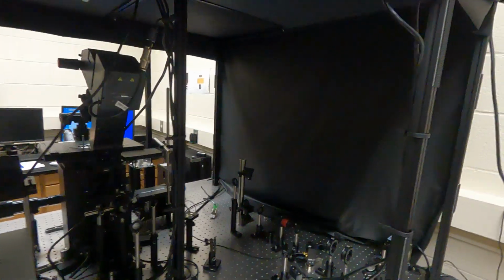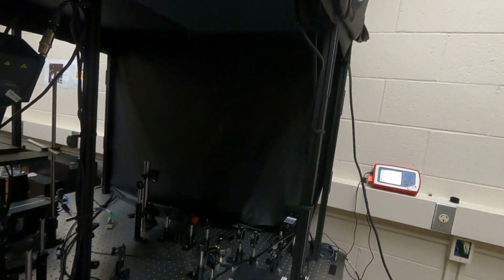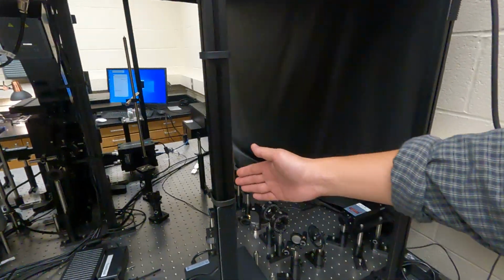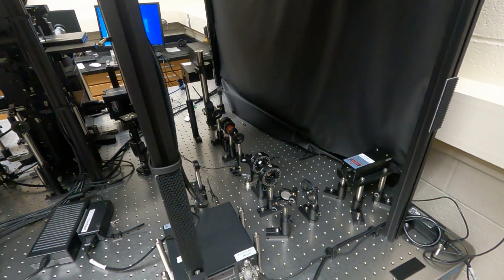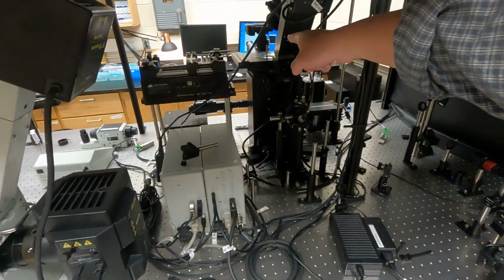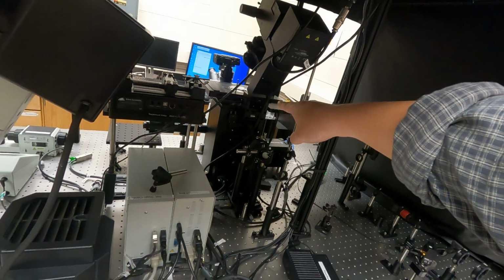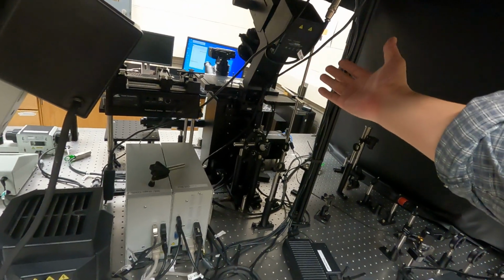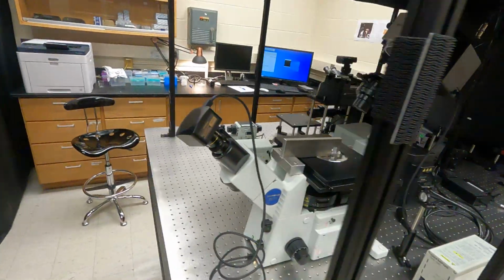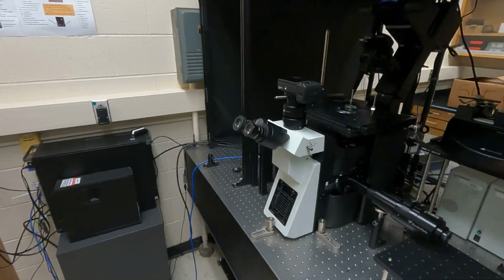This instrument contains a few essential components. The first one would be the laser unit here, as well as a bunch of optics that modulate the laser beam for excitation purposes. We have the microscope body, which is where we place samples, and it also provides a framework so that we can modulate the excitation laser and collect emission.